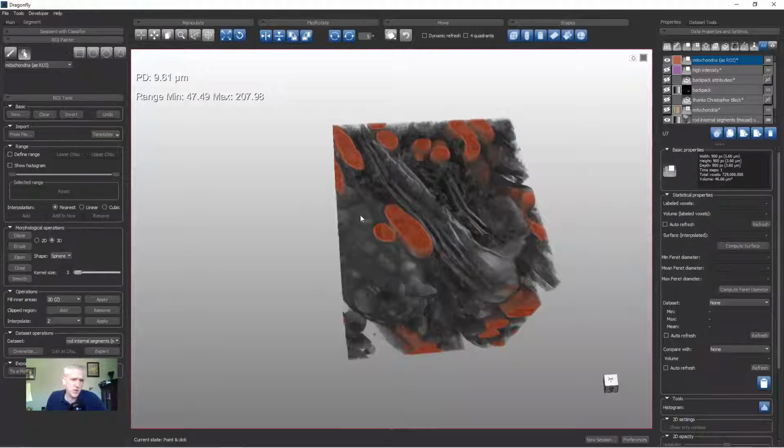Maybe we should have another follow-up lesson on ROI Painter since there's so much here, but I'm just going to remove some of these because I feel like pruning my data. So that gives you a lot. I know this is not a very organized lesson.